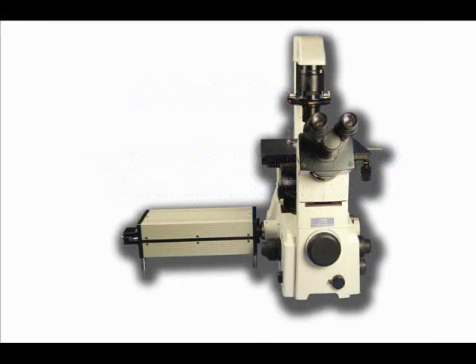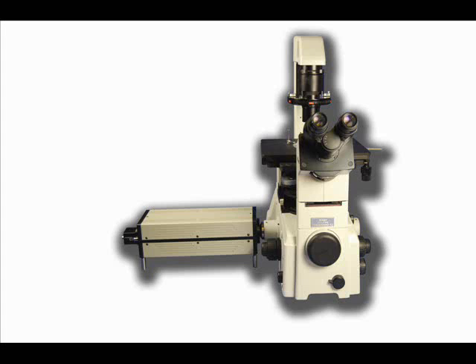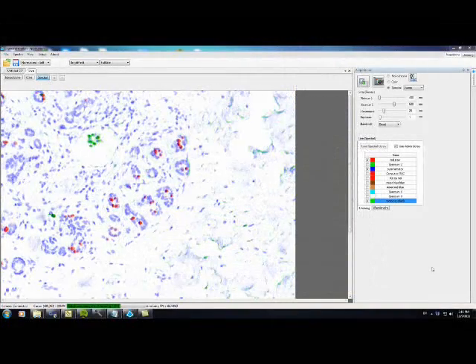Guch and Hausko's patented Acousto-Optic Tunable Imaging Technology fulfills the promise of spectral imaging through unmatched image quality, spectral flexibility, and switching speed. The performance capabilities of this technology make it ideally suited for high-content, high-throughput fluorescent studies, as well as spectral transmission and reflectance imaging. Potential applications range from live cell and whole animal studies to standoff detection.